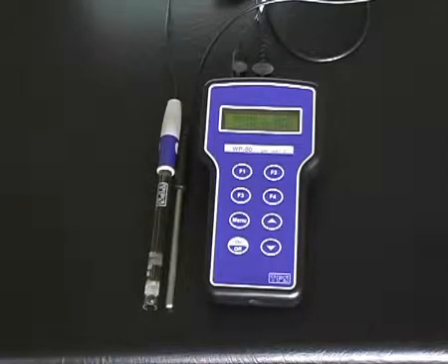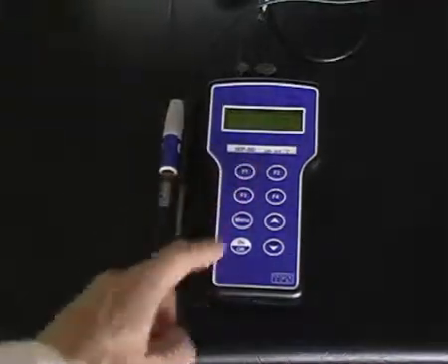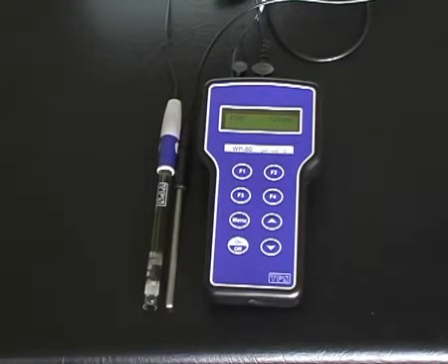To calibrate a TPS WP80 pH meter, the calibration procedure is the same as the 90F-LT. First, press Menu and then press F1 to Cal. To complete the calibration, however, press F1 instead of Enter.